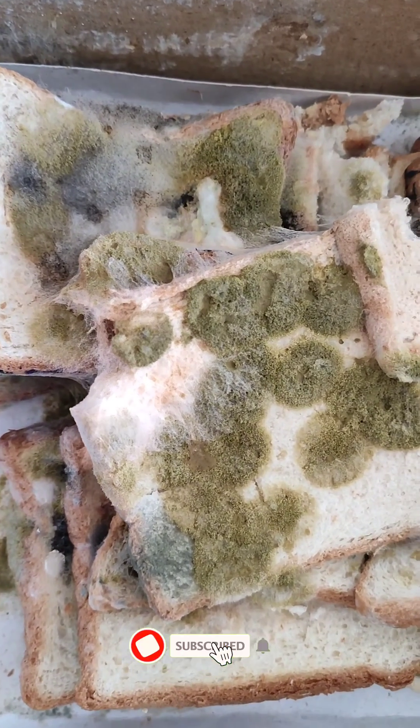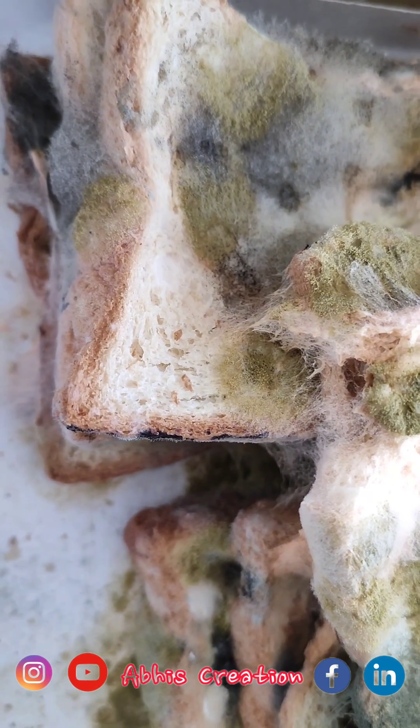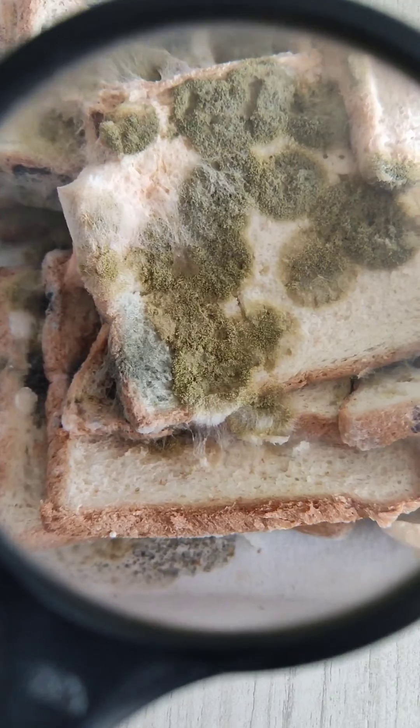Hi, this is Abhijit and welcome to Abhi's Creation. Today we observe the bread mould or Rhizopus fungus. In microscope it looks like that. First we observe through the magnification glass.